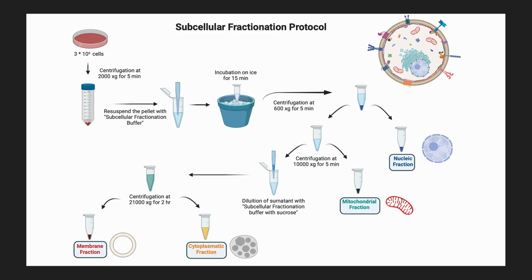Subcellular fractionation is a pivotal technique in cell biology, enabling the isolation of cellular components such as organelles, membranes, and macromolecules for detailed study. Fractionation refers to breaking a complex mixture, such as a homogenized cell suspension, into its individual parts or fractions.